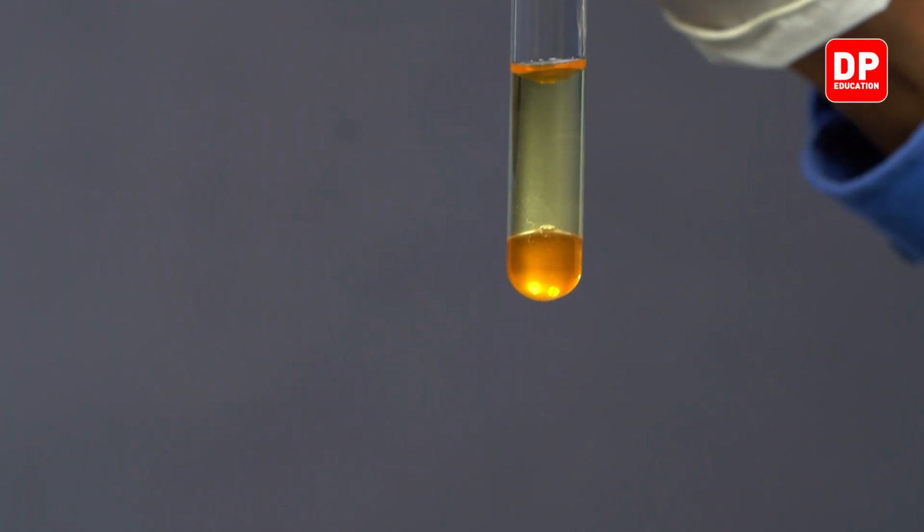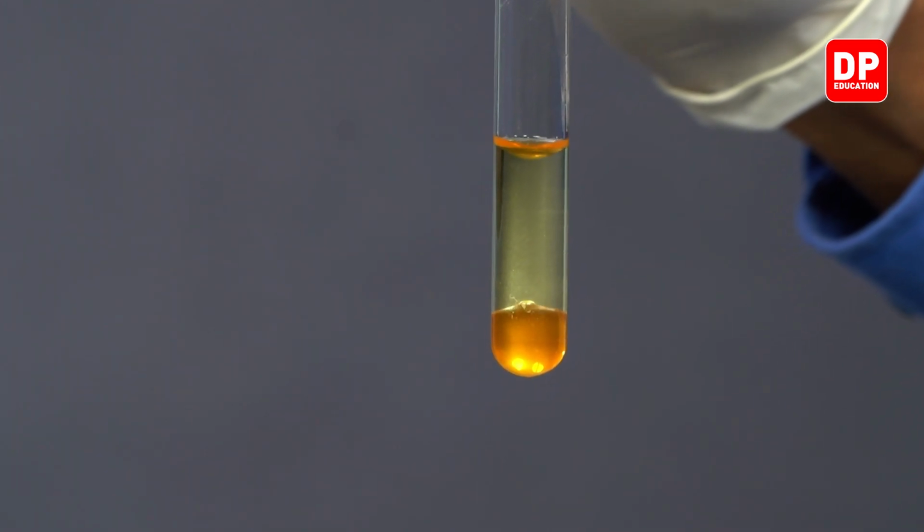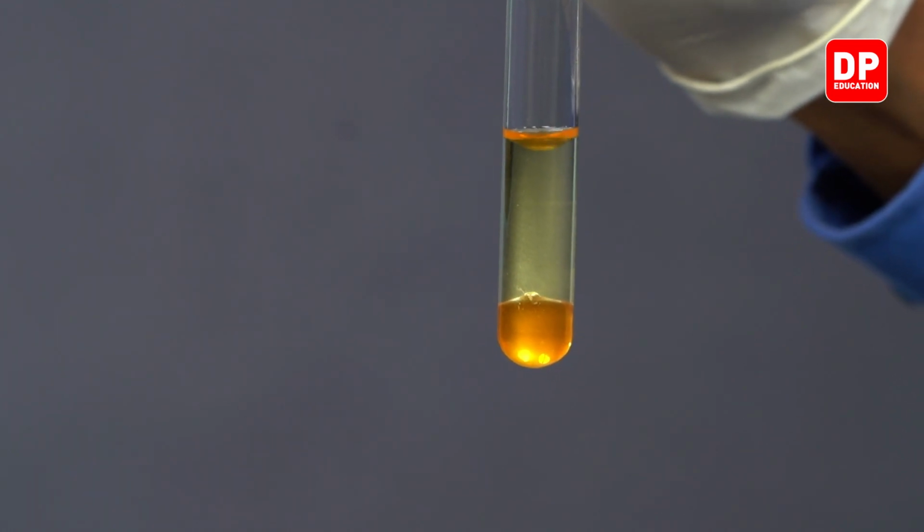So as you can see, these are the observations when we add chlorine water into a bromide ion solution and then mix it with carbon tetrachloride.